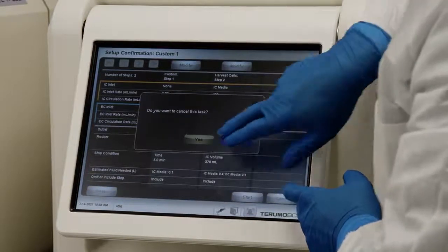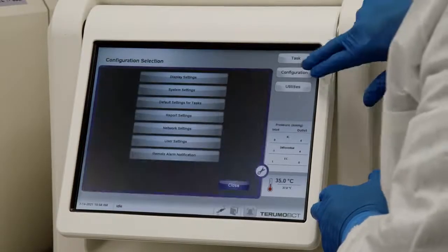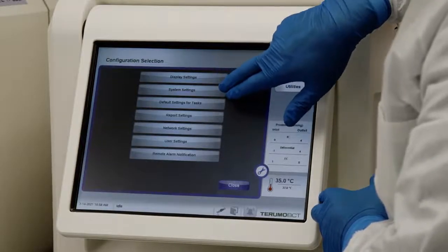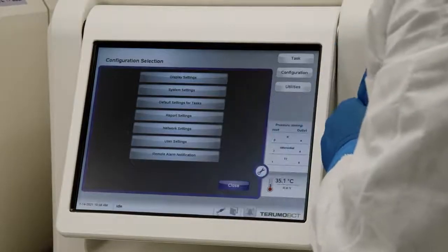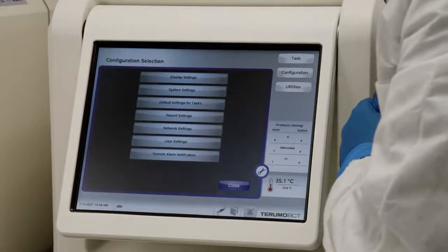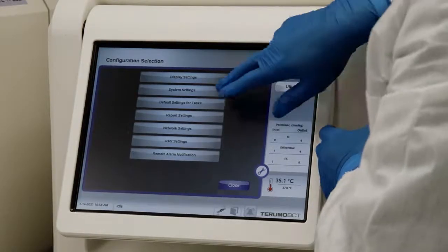Let's talk more about configuring the device to better suit your needs. Here you can change the display settings, the system settings, and the task settings and set up user permissions. Once your protocol parameters are set up, you can store them in the system's memory through configuring the default task settings.